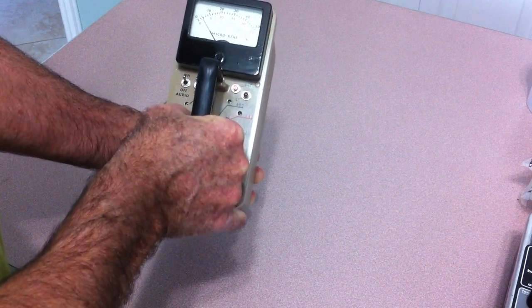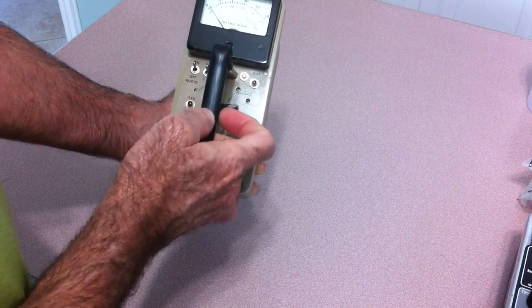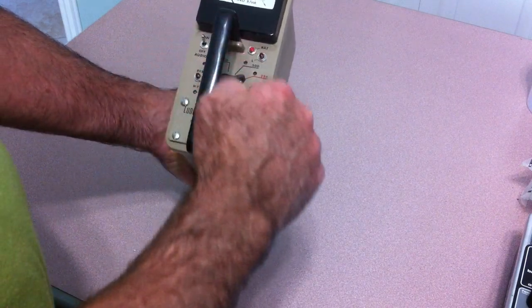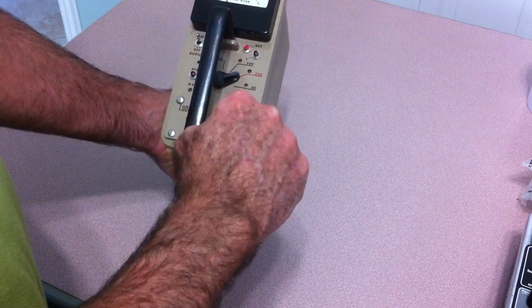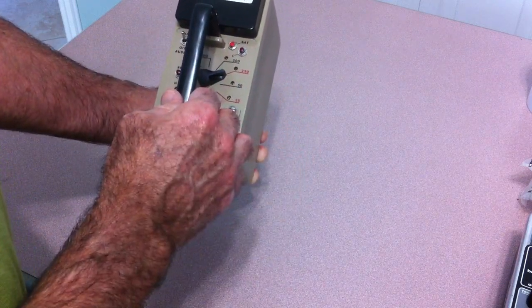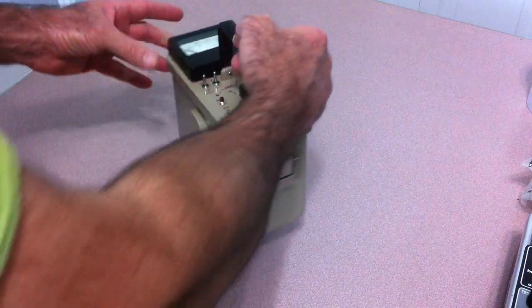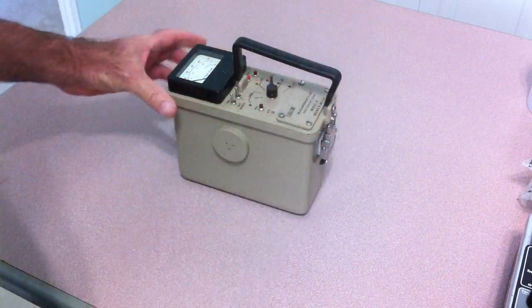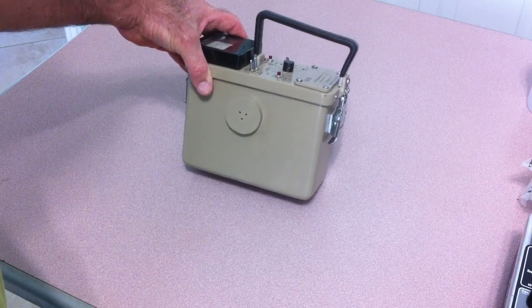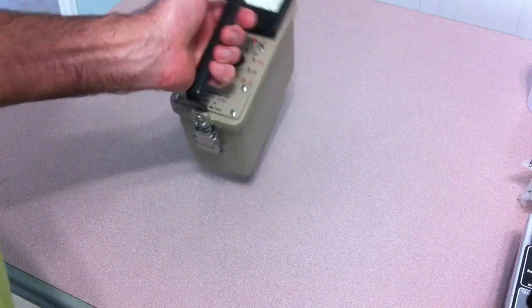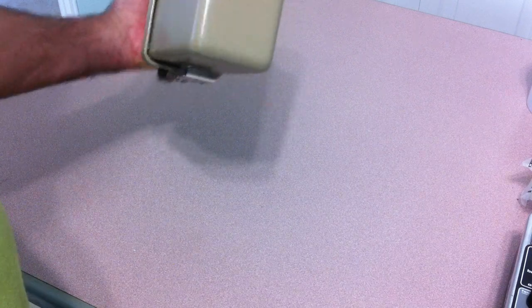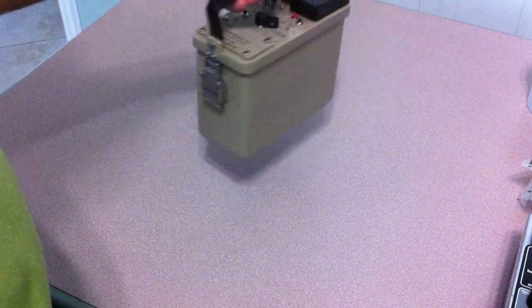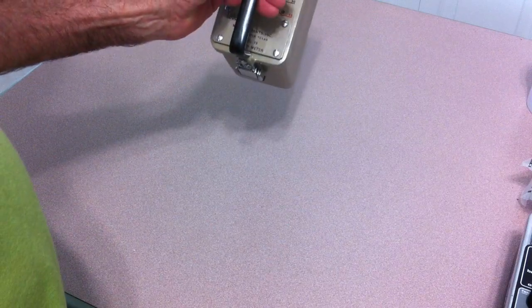And then this is a meter reset button that is functional as well. It's got all the pots that are clean and fully functional for setting the calibration of the unit. The unit has been completely cleaned, stripped, and repainted with the standard Ludlam beige paint and it looks beautiful, looks like a brand new unit, at least a brand new unit as of the model year that this one came out.